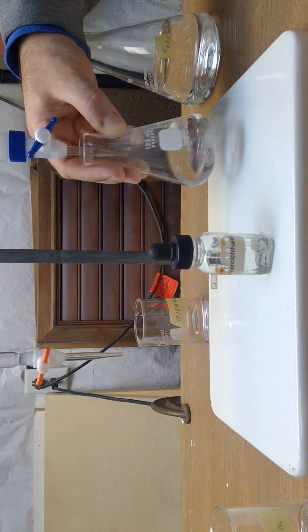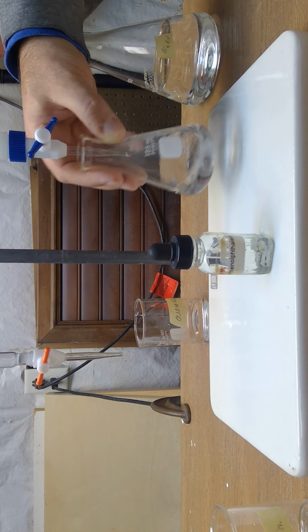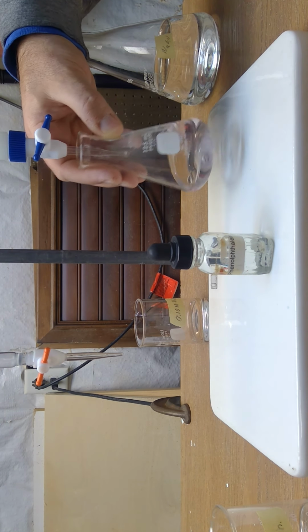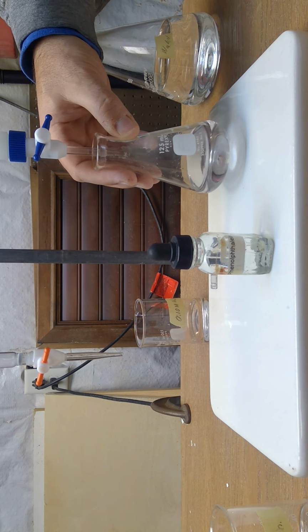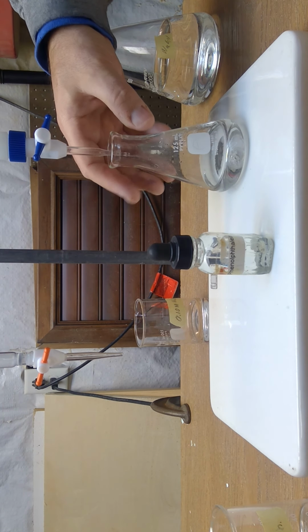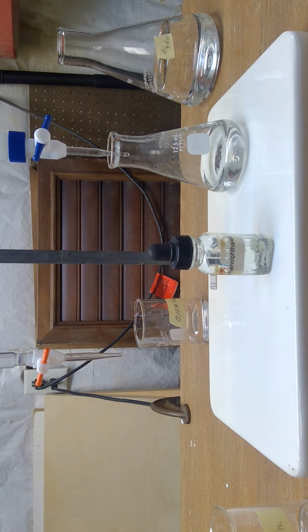It does get tedious. And I think we're just about there. Right, so the pink stayed for quite a bit. I'm going to take a quick reading before I add the next drop, just in case it goes too far. So this reading right now is about 20.29, but I'm going to add another drop just to see what happens.